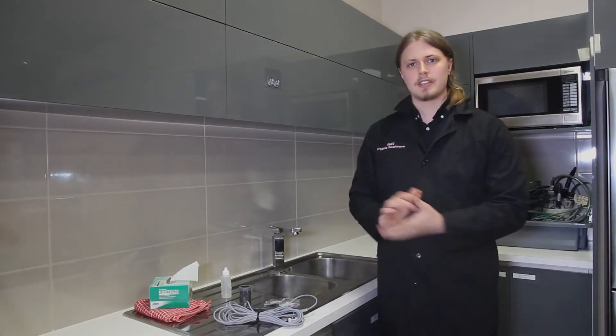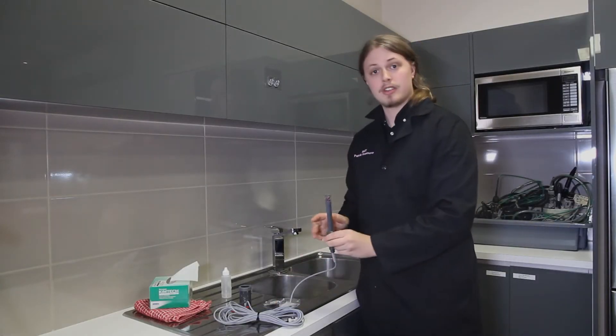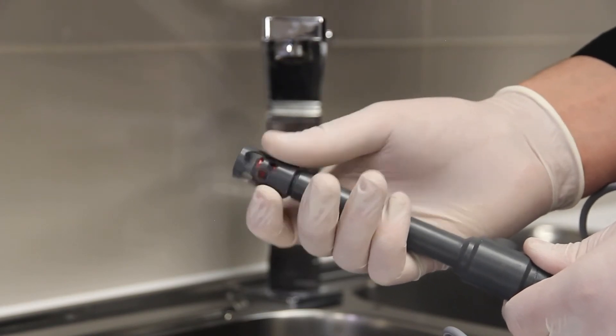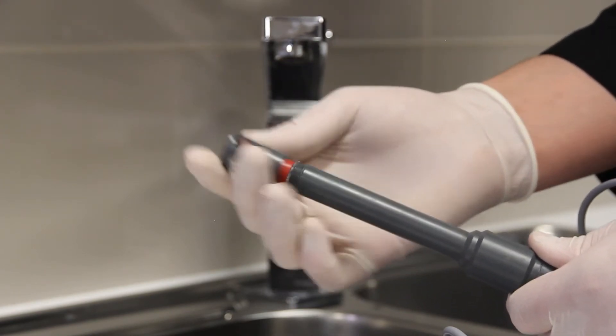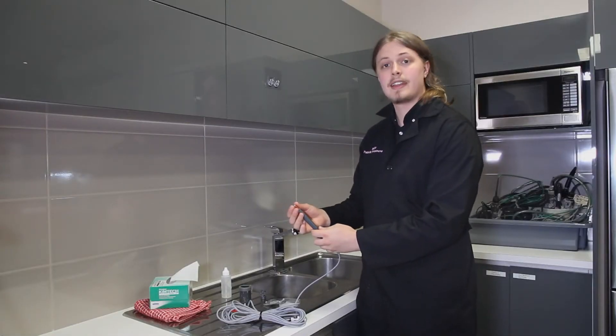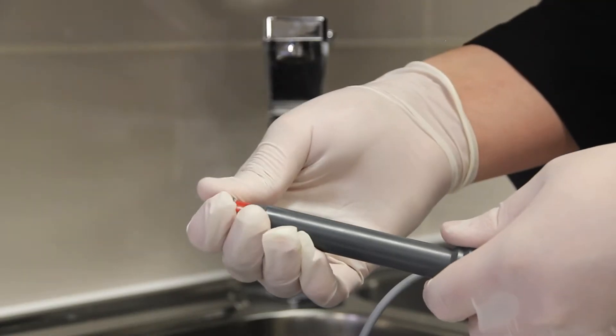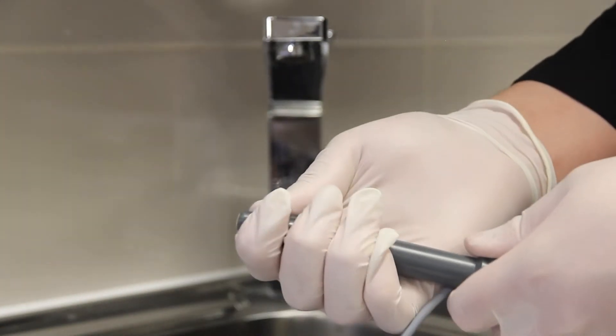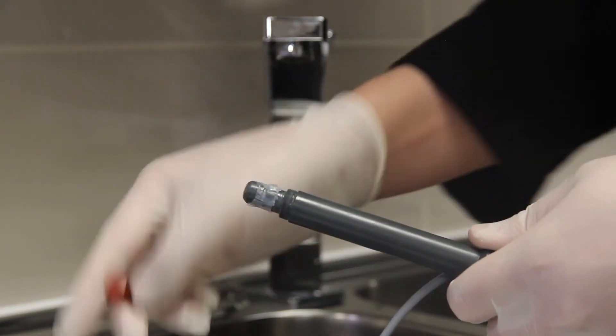Okay, first take your sensor and remove the tip by unscrewing it. Set it aside, then remove all the components from the tip by sliding them off with your finger and thumb, and place those aside.